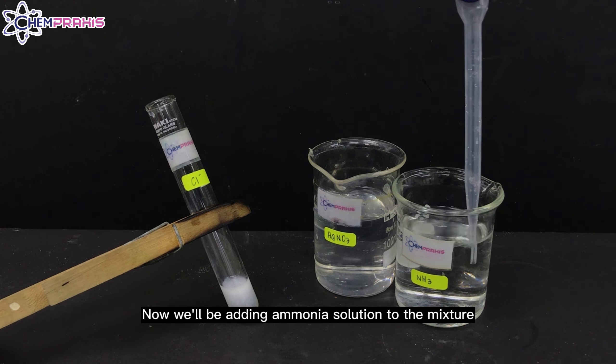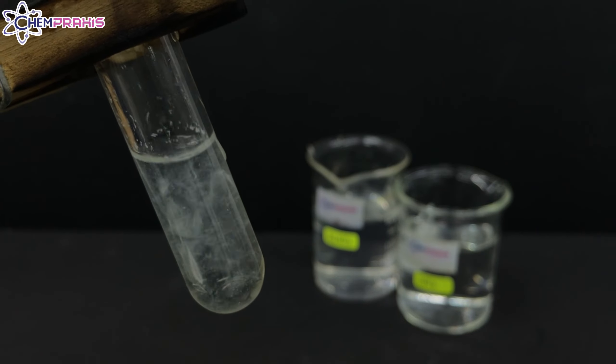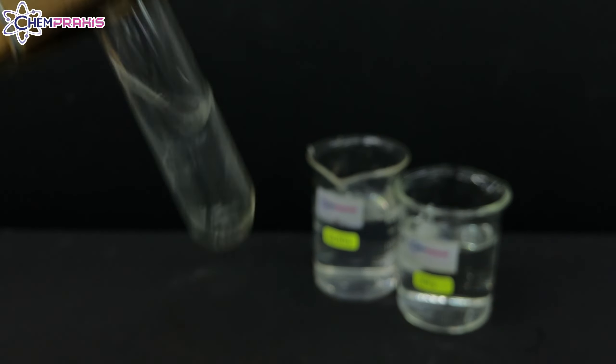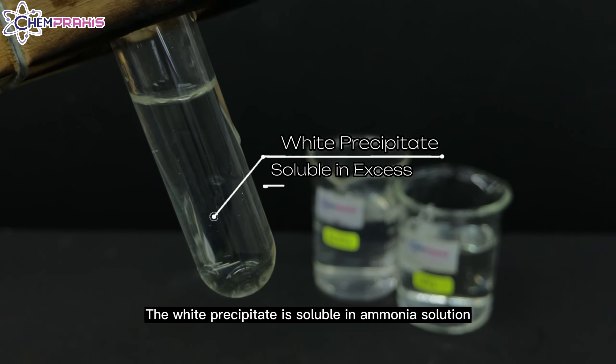Now, we will be adding ammonia solution to the mixture. The white precipitate is soluble in ammonia solution.